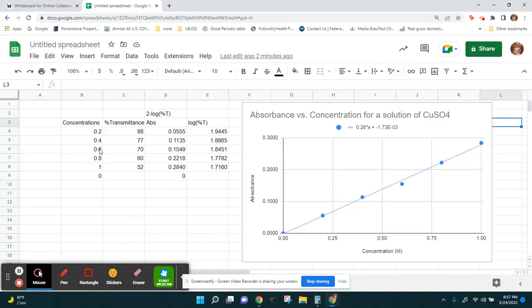All right, so you need to turn in the concentrations versus absorbance, and then you also need to turn in a graph, and also calculate, which is basically the main thing, the concentrations of the unknown solutions. Right, the two unknown solutions that I gave you. Give me the concentrations using this slope in order to help you calculate those.